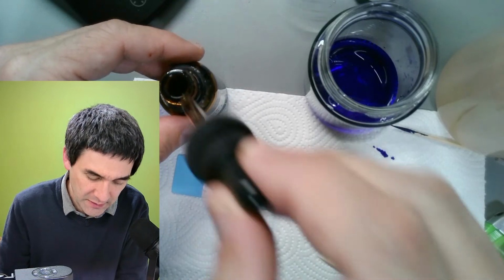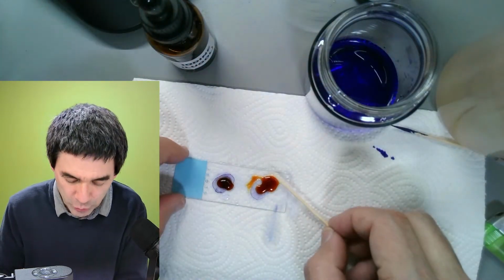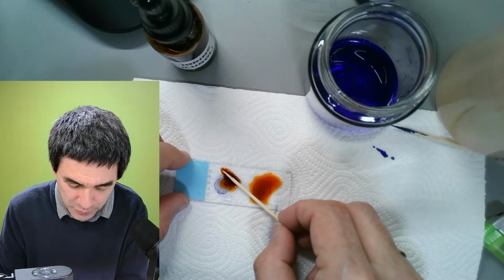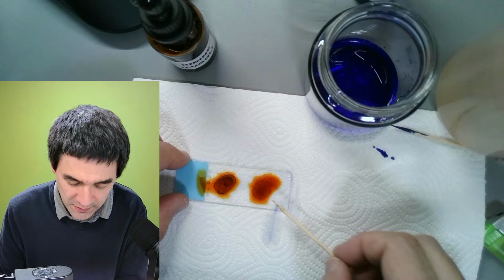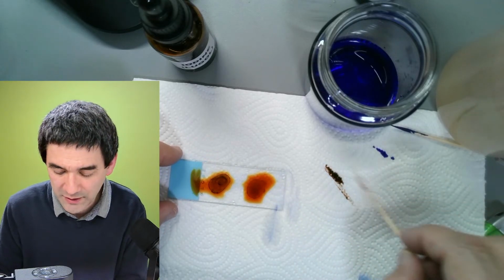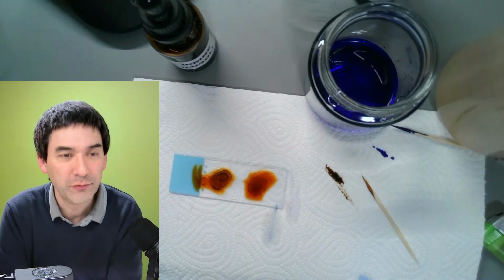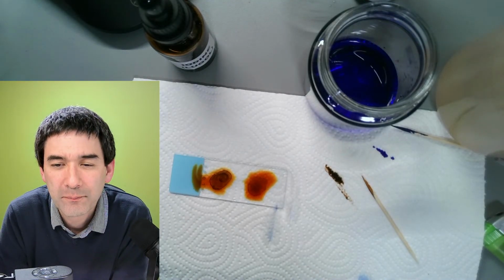And because I like to not use too much of this, that's why I just put a drop on here, and I again use carefully a toothpick to spread it across. I'm just doing this so that I don't have to use too much of this iodine. Look how the iodine reacts with the cellulose here. And I have to wait a minute again. Yeah. So I'm reading again.